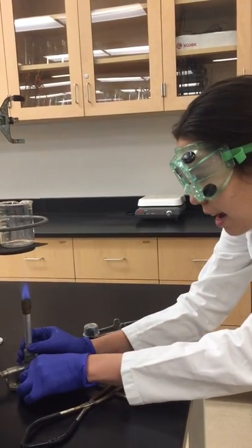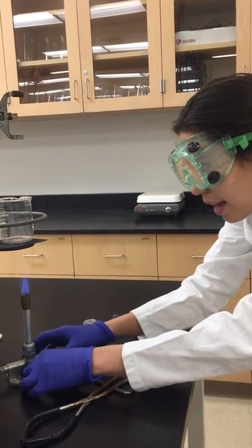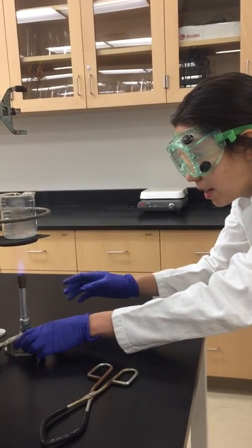We want to adjust the air intake valve so that there is a light blue cone right here, and the flame hits the bottom of the beaker like this.